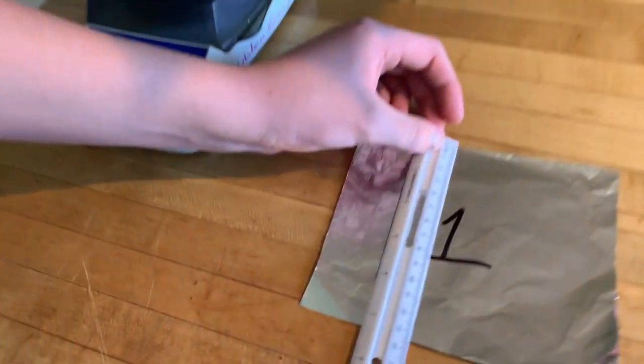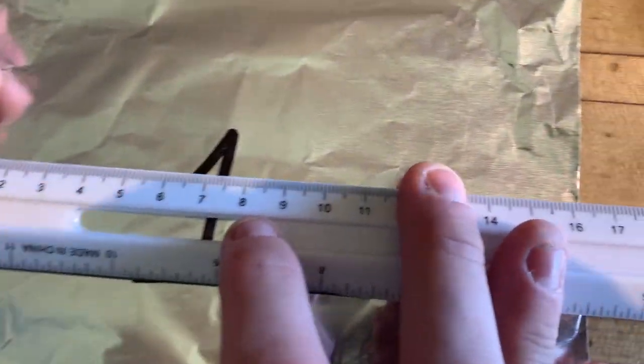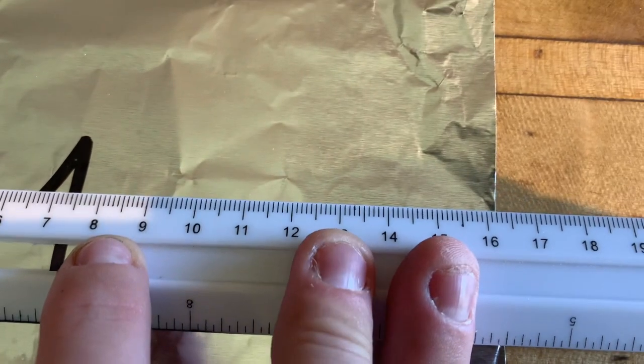As Maurice is making the measurements, you should be writing down — according to appropriate significant figures — what those measurements are. Remember: everything that the instrument tells you, plus an estimated digit.